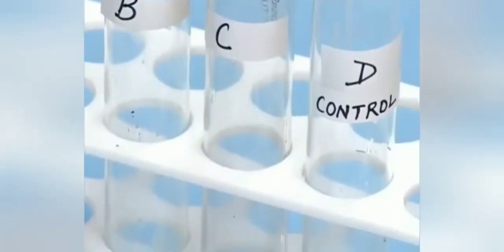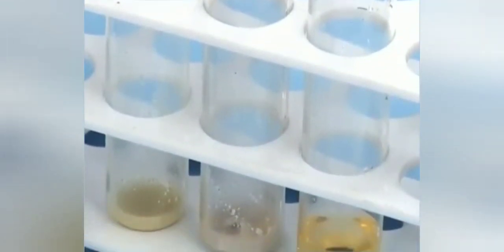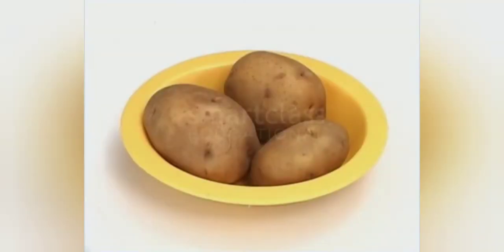You can also observe that no change has occurred in the test tubes B, C and D. Starch reacts with iodine solution to give a blue-black color. The test tube containing potato showed blue-black coloration. This confirms that potato contains starch.